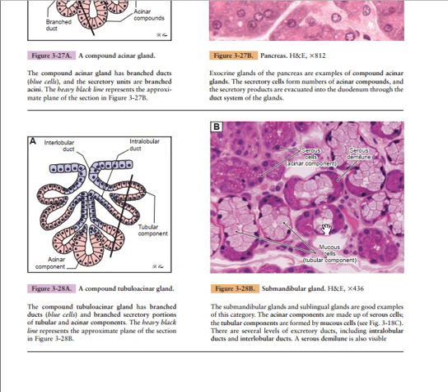In the submandibular gland, you also remember that it was a mixed gland, that is, it has a serous part and it has a mucous part. The serous part produces the demilune and the mucous part is at the center and it is whitish. It's not whitish all around. So in order to know that it is a mucous cell, you have the nucleus at the base, and it is whitish at the top. Is it clear? Whereas in a sebaceous gland, the nucleus is in the center and it is whitish all around. Is it clear? That's the difference between a mucous gland and a sebaceous gland.